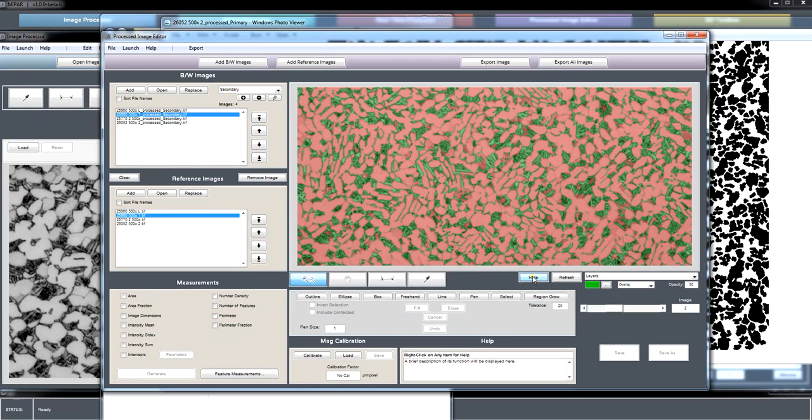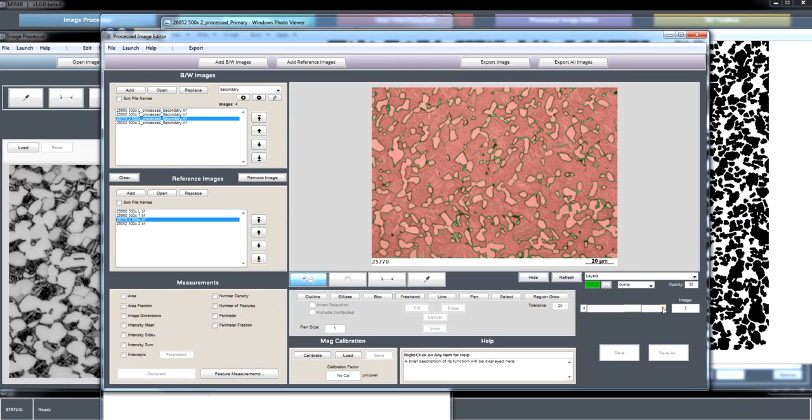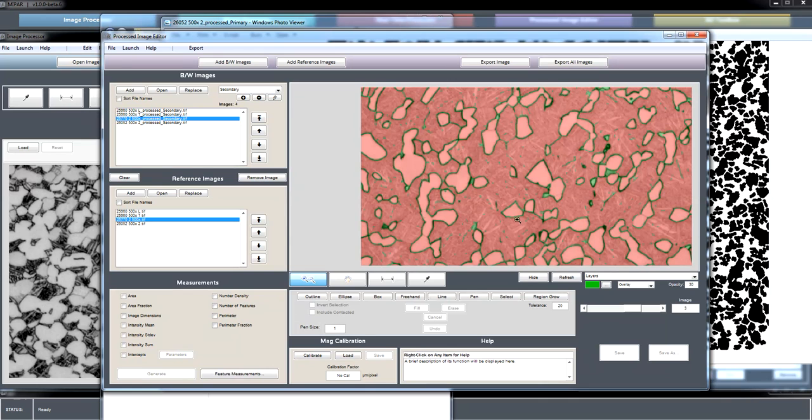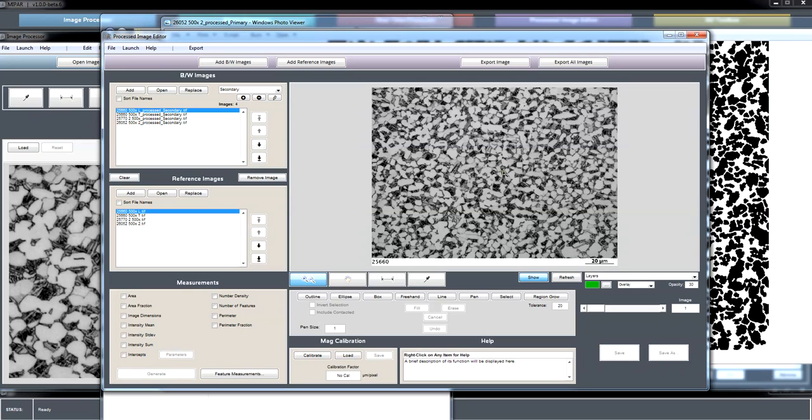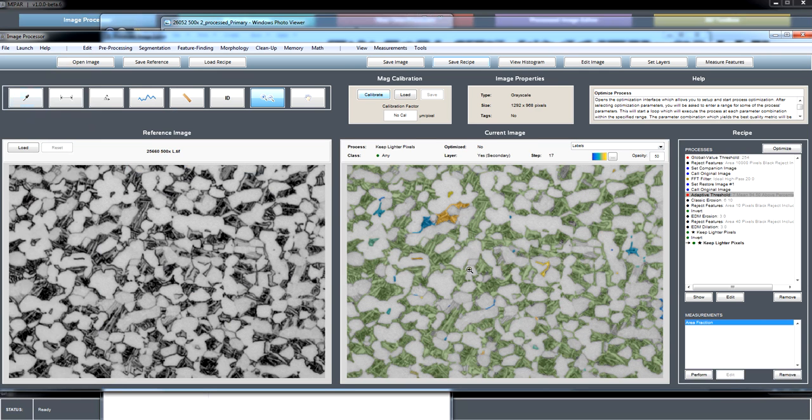set at, yes, and thank you Meg for giving me an out and saying why it might not work well. I'm determined to make it work well, and I'm sure it will, so let's just try to optimize that adaptive threshold step and see how it goes. So that one's acceptable. That one is obviously unacceptable, and that one is also probably not one that you'd want to quantify. So the first one works well. The rest do not. So let's go back.